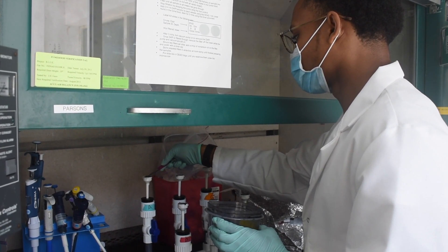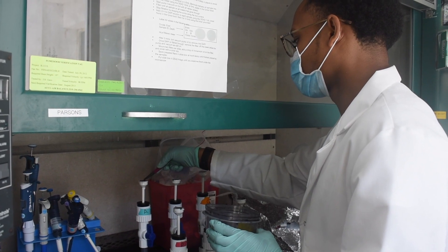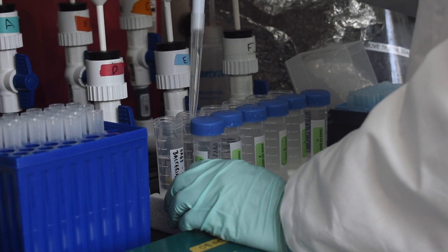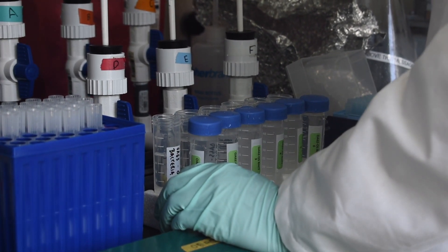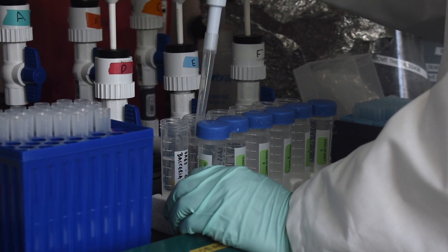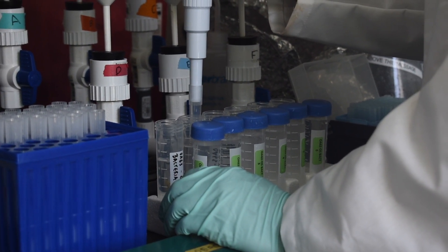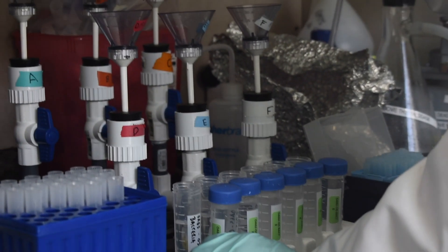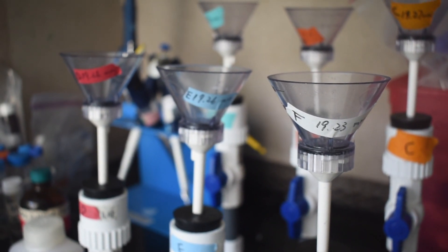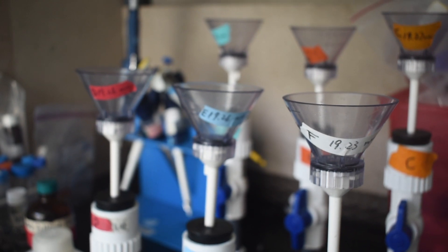We put the filter on the towers and then we clamp the tower to the base and we filter anywhere from 3 to 40 mils of seawater depending on where it's from. So for instance inshore in Bermuda we usually do 3 mils, offshore deep in the ocean we'll do 40 mils.